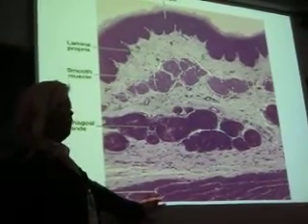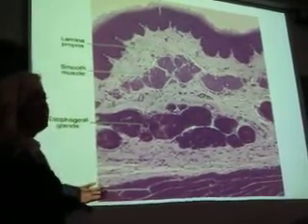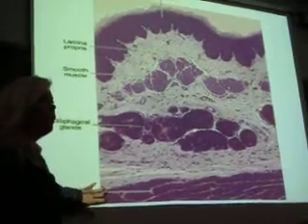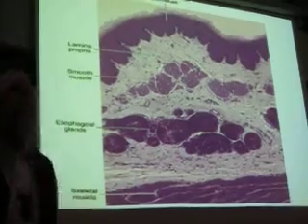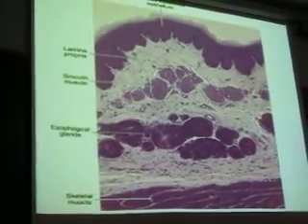You can look for the presence of skeletal muscle. Obviously, it's not going to be labeled when I examine you guys, right? But you should know what skeletal muscle looks like under the microscope. And also you can look for that stratified squamous epithelial tissue.